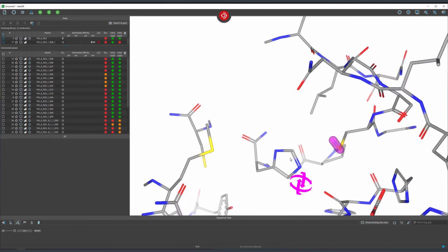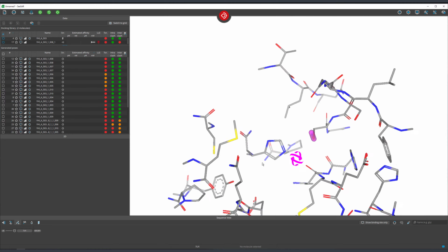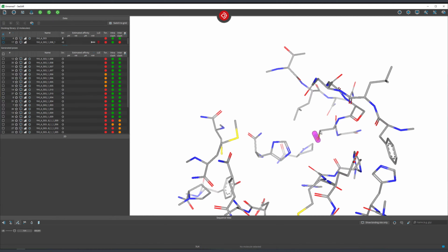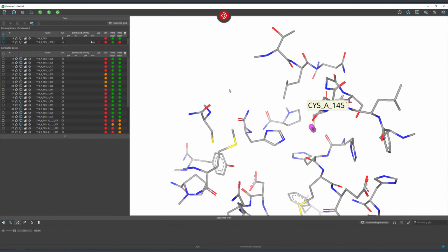And that is that we notice, in the vicinity of this particular cysteine residue in our binding site, another residue conveniently positioned that can also be a host for covalent ligands, which means that this could also act as a receptor for covalent docking, and that's a methionine residue.